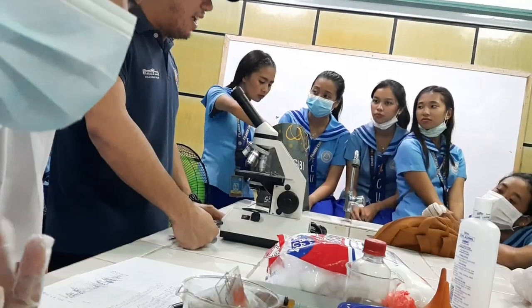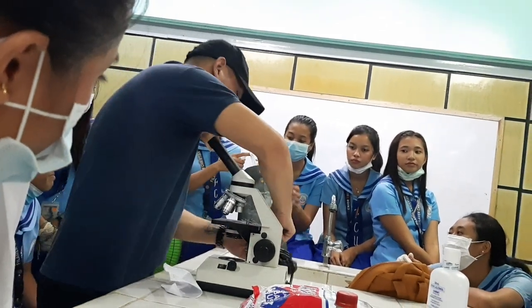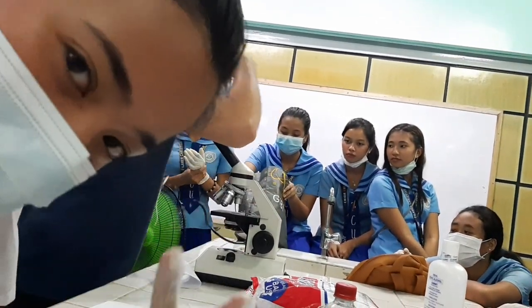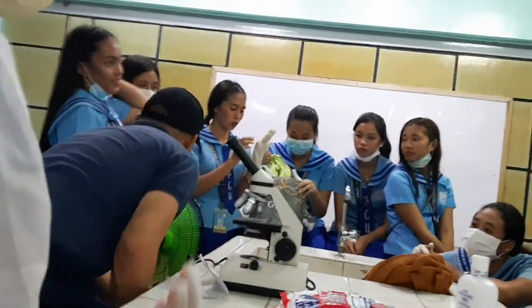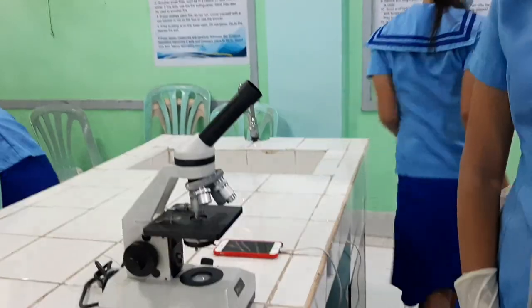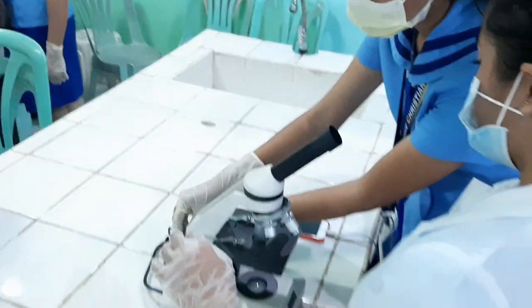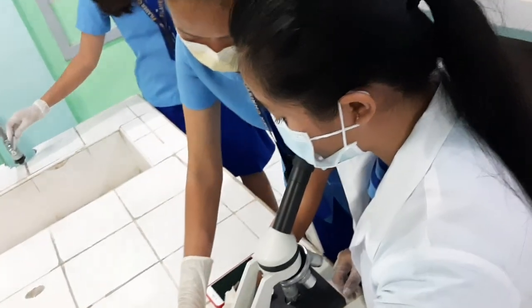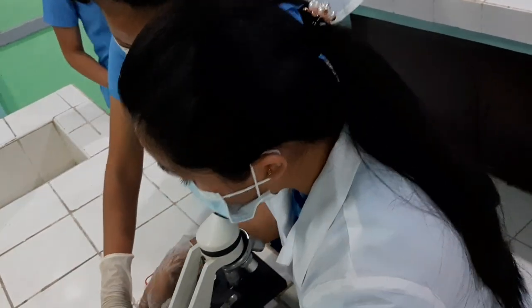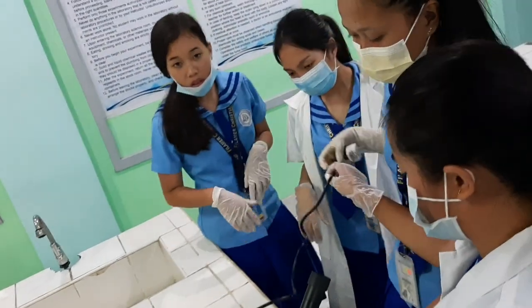Okay, sir. Okay? Okay, so amo ina ang okay, atong niya protocol. Okay, so dapat iya saksak na yung yeah. All good. Okay, so isaksak na tanan ng microscope. So, guys ha, be very careful ha. Magsaksak ka mo kung basa tanan mo na nararala. Okay, then saksak lang. Okay, of course, at inalalong nyo pa sa specimen. Okay, so sa taga group, isa katawa.